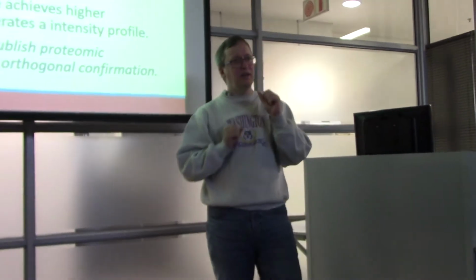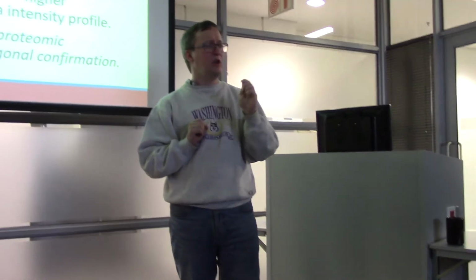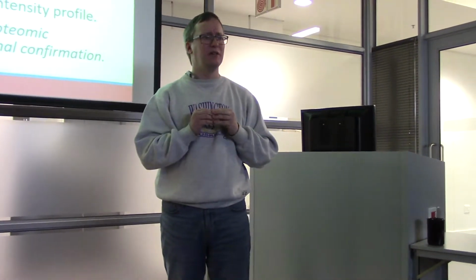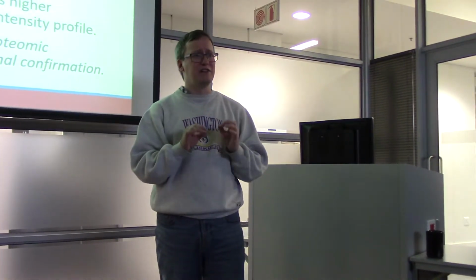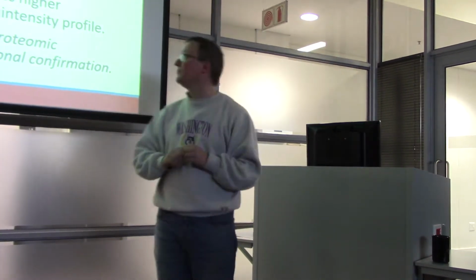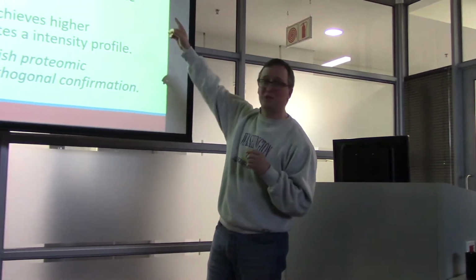If you want to be much more precise than that, if you want to be able to answer questions about whether or not you can trust a 20% change for some peptide, it's really very important that you step away from shotgun experiments and focus on experimental designs that are targeted at a particular set of peptides. And for that, we have methods like SRM, which we're going to be talking about from this.